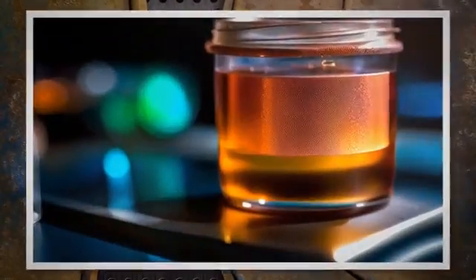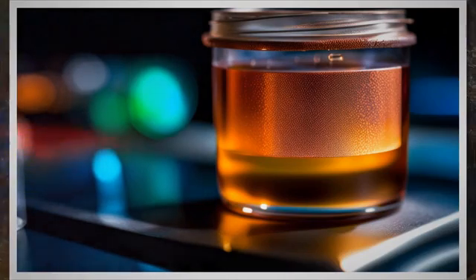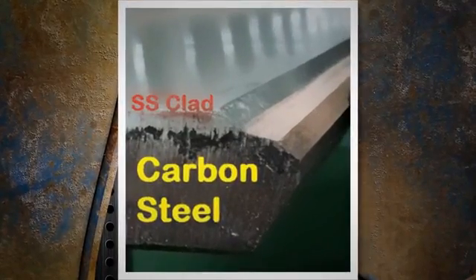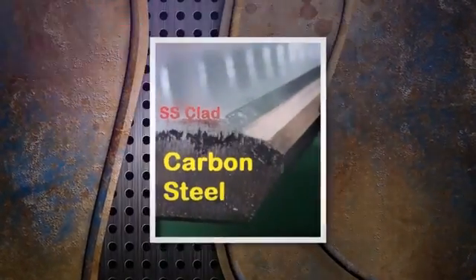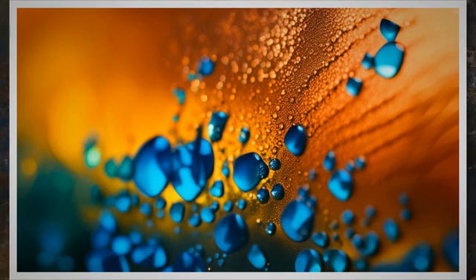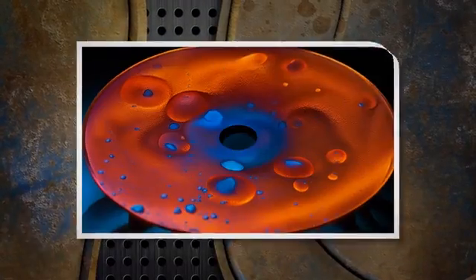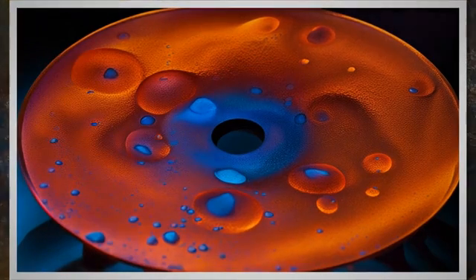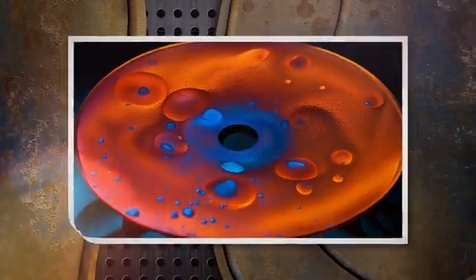The copper sulfate test is used to determine whether a metal has been properly passivated and can serve as a quality test to decide if further passivation is required. For a passivation check, apply the copper sulfate solution on the material surface at ambient temperature for approximately 5 minutes, then rinse and dry the part completely and carefully. If any copper deposit is present it can be noticed visually — a pinkish to brown color indicates free iron is still on the surface and further passivation is required. The test is acceptable if no copper deposit is present.